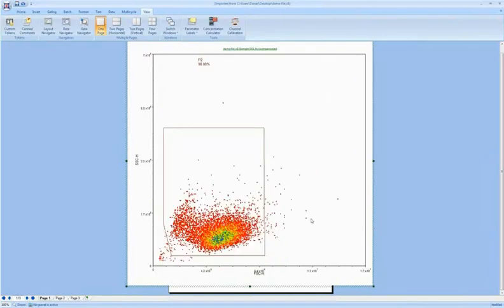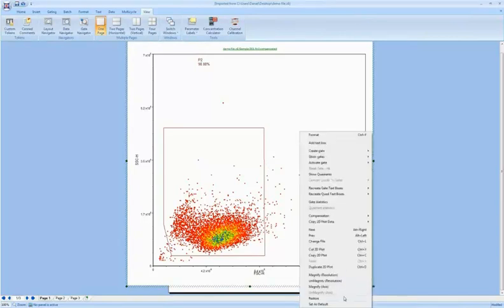With other kinds of data where the dynamic range is not so big, it's much less of an issue, so you can choose to use either one. It will affect how values are counted: when you zoom with the resolution, for statistical purposes, all of the values that are outside of the range get included on the axis. When you zoom with the axis, the values get included where they were originally. That's another subtle difference, but the differences in statistics will be extremely minor. Let me restore that.